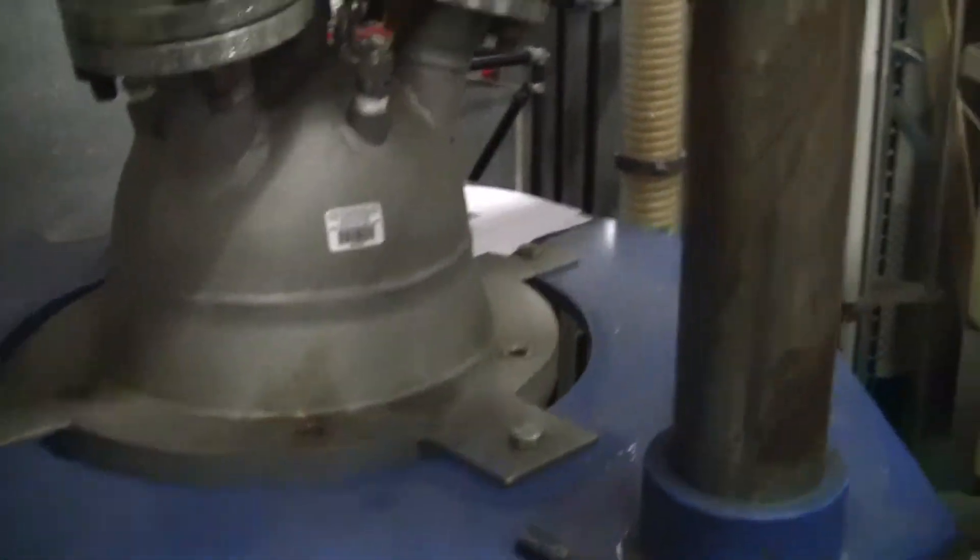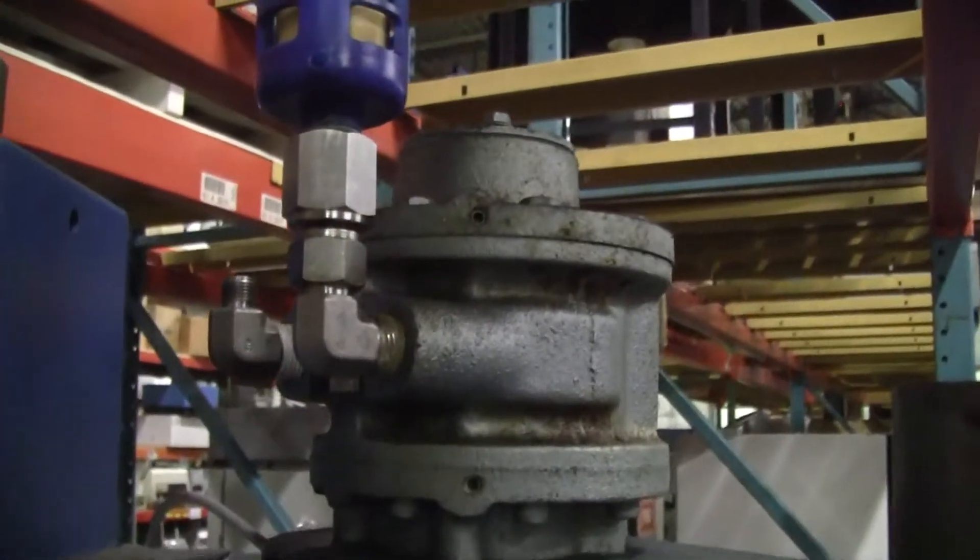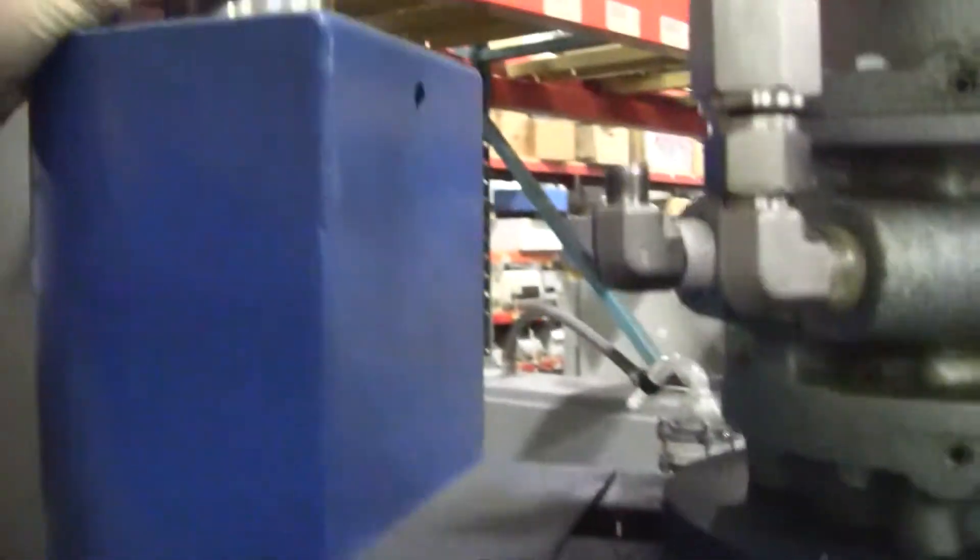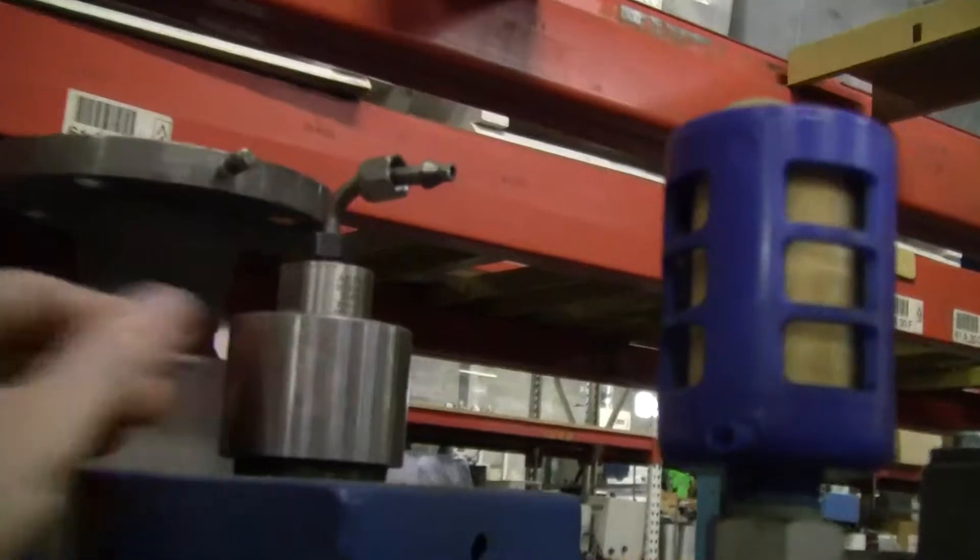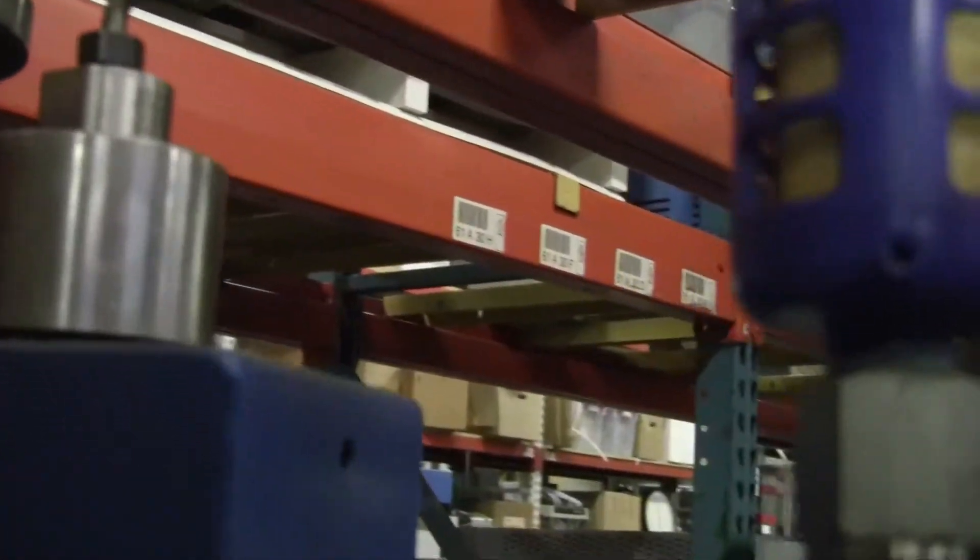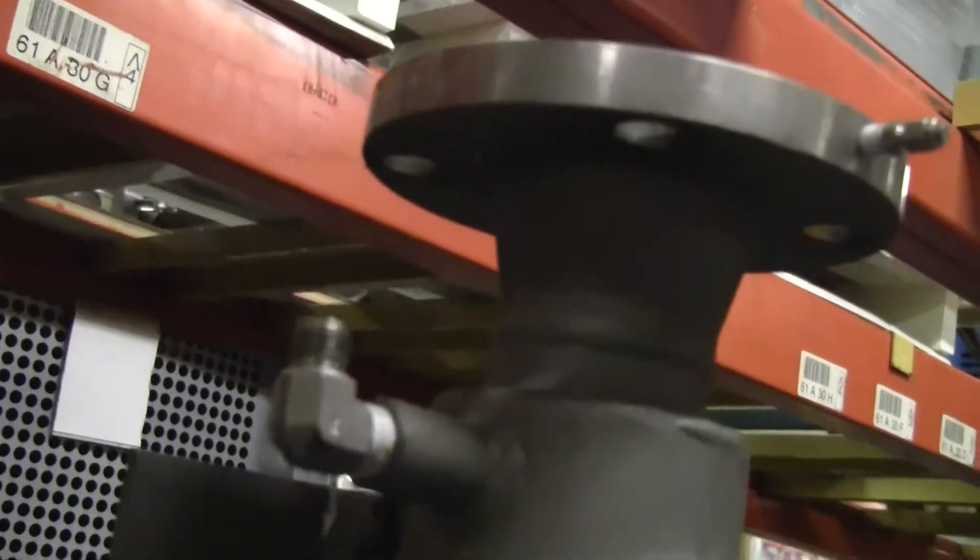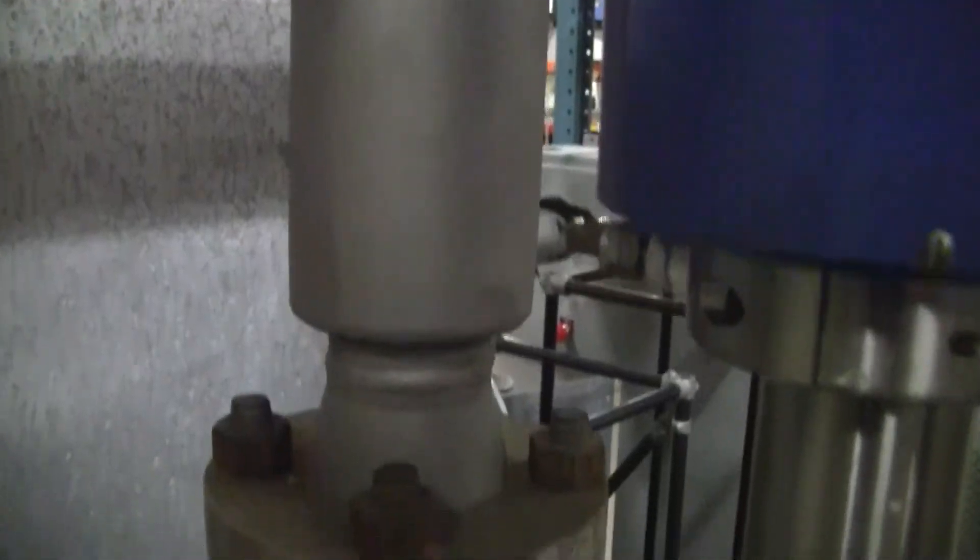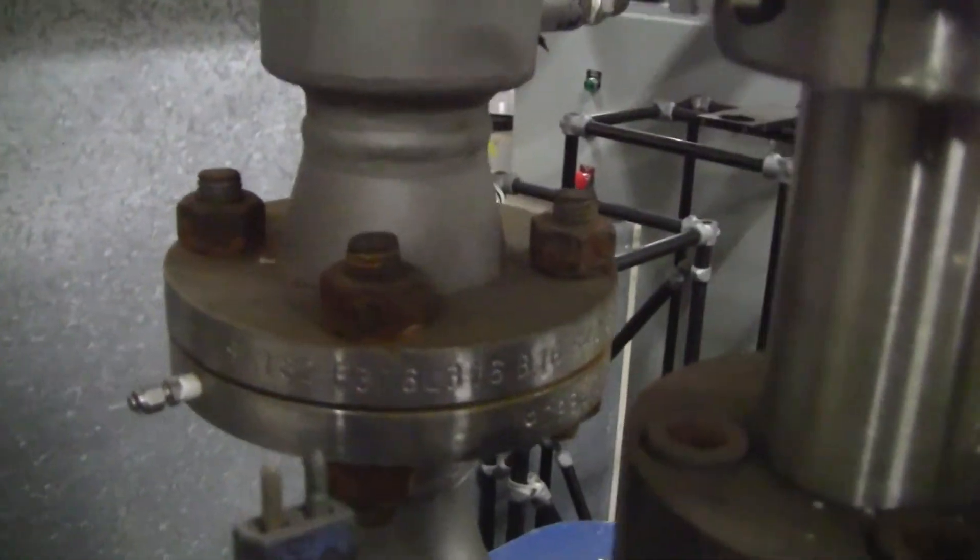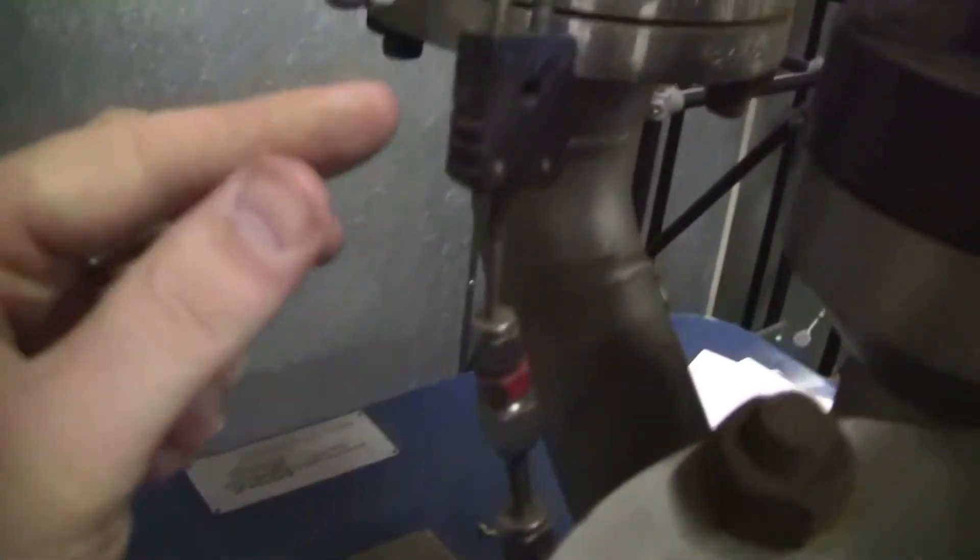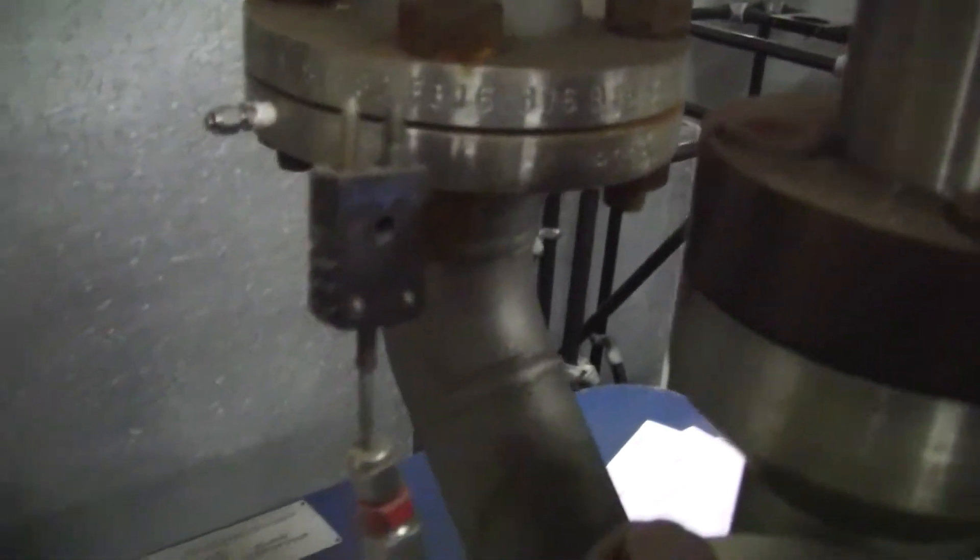We'll take a look at the top of the unit first. You have your arm here holding up your air drive motor, top of the head, moving down, J-type thermocouple port.